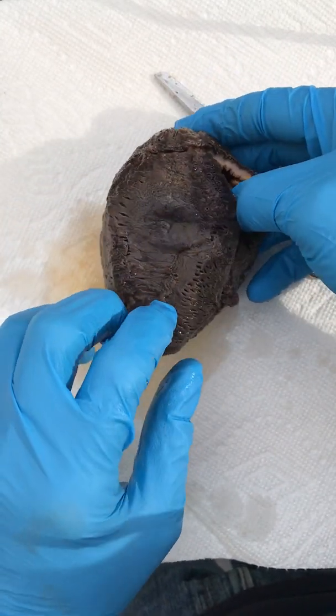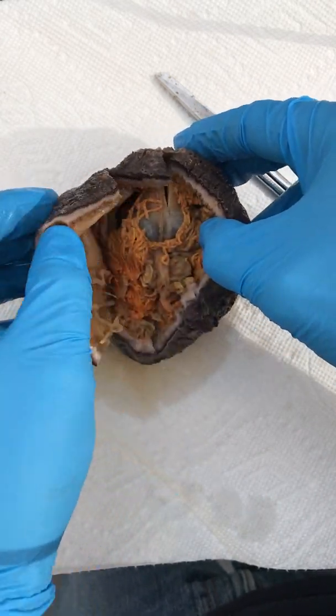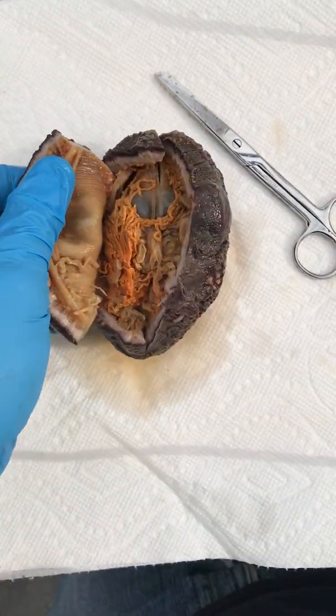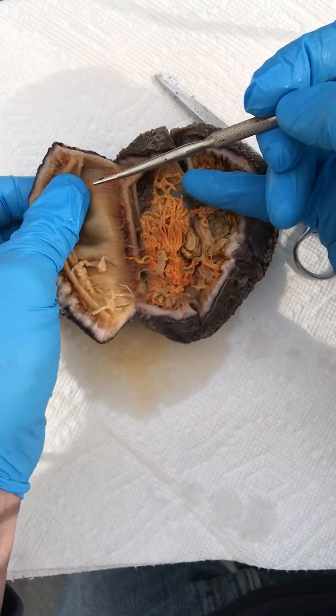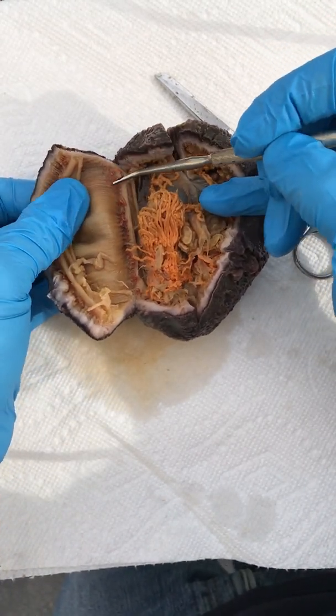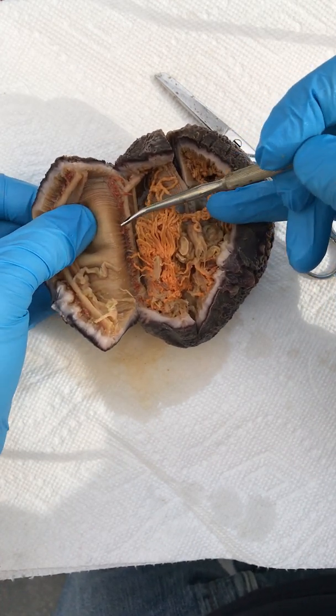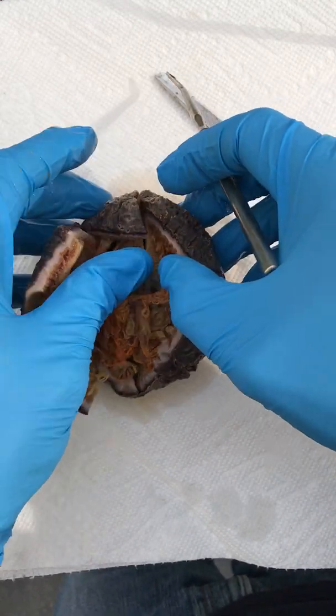On the outside, the tube feet are kind of hard to see — they tend to get sucked in as well when they're preserved. But on the inside you can see these little reddish structures. These are the ampullae, and those are connected on the other side to the tube feet — similar ampullae to what you'd find in the sea star if you watched that dissection.